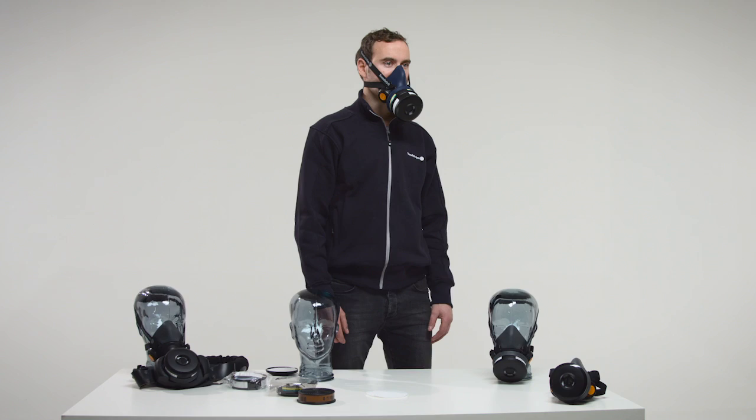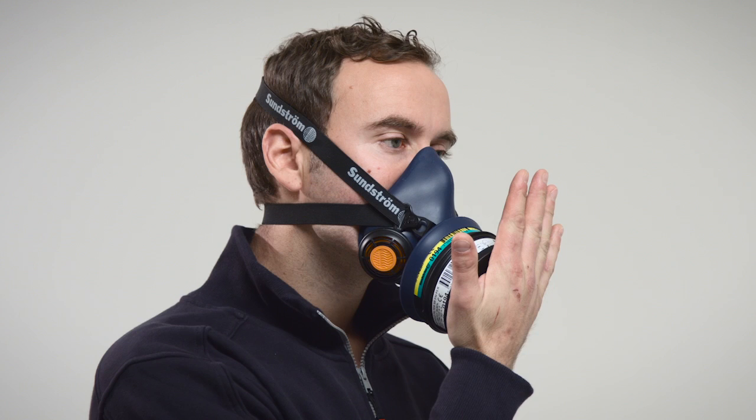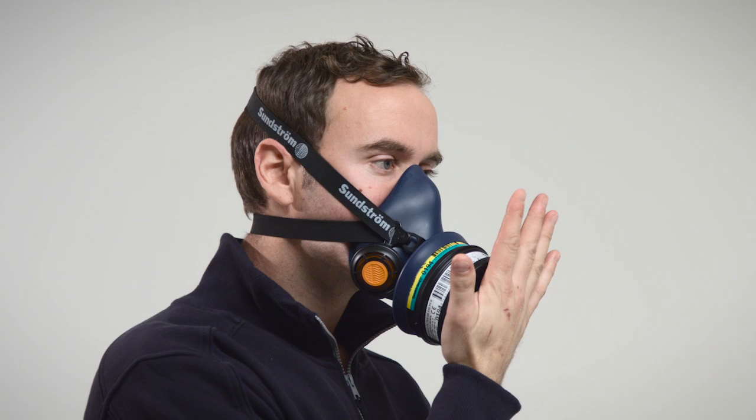Fit check. Use the pre-filter holder to check if the mask is tight. Place the palm of your hand lightly over the hole on the pre-filter holder to make it tight. Do not push so hard that the respirator's shape is affected. Take a deep breath and hold your breath for about 10 seconds. If the mask is tight, it will be pressed against your face.